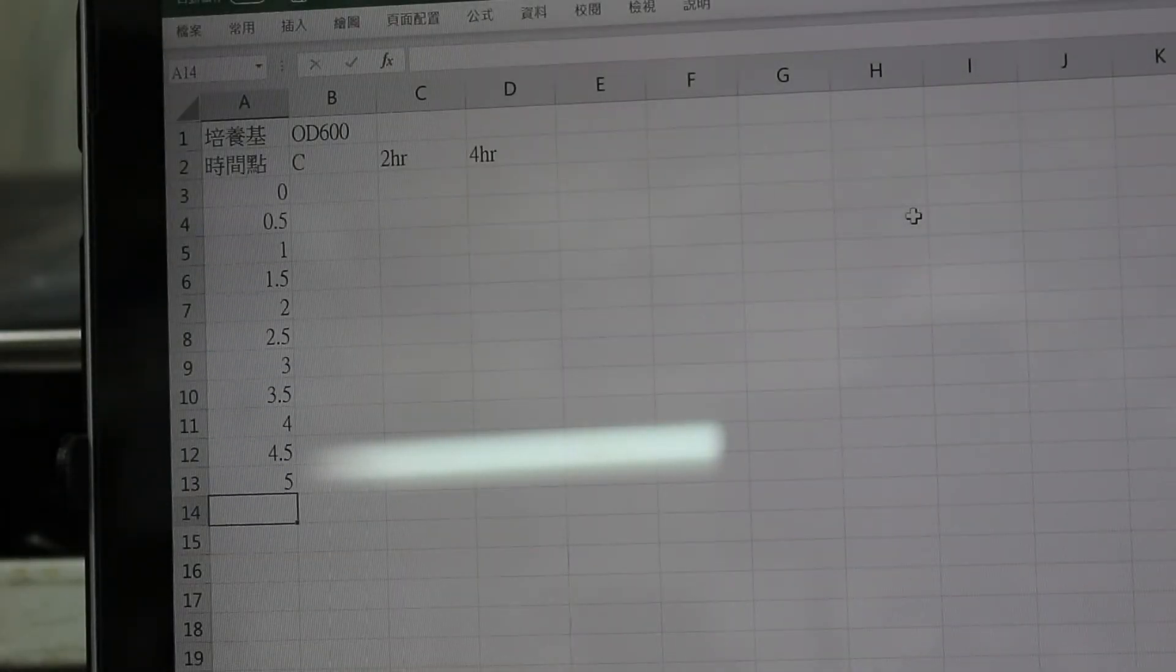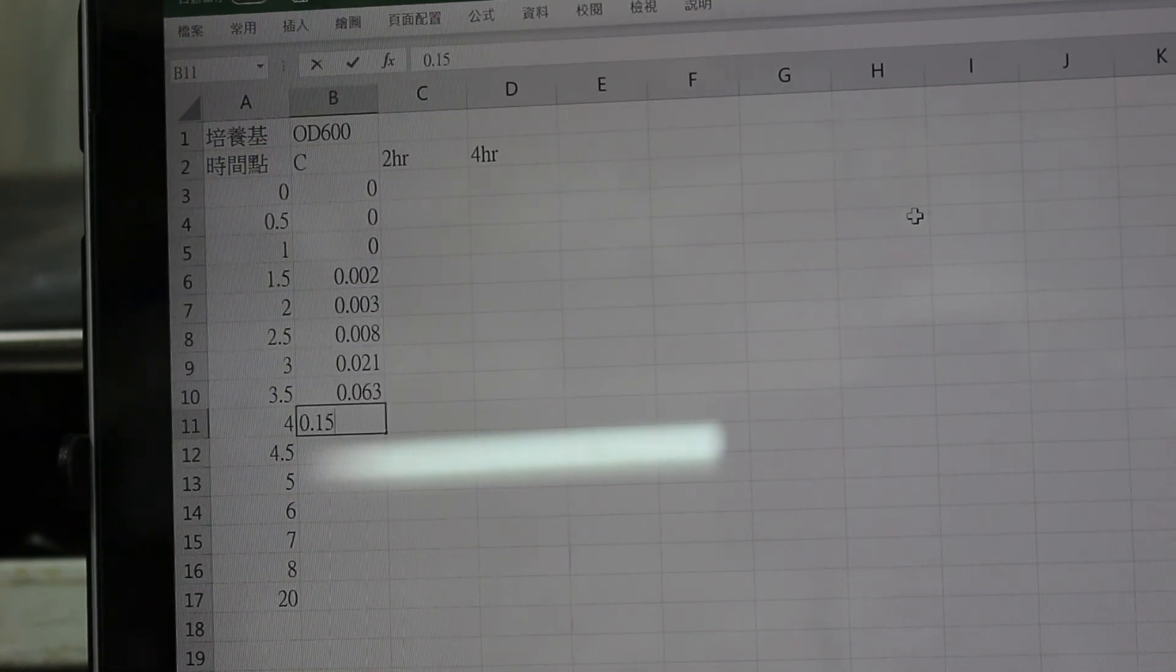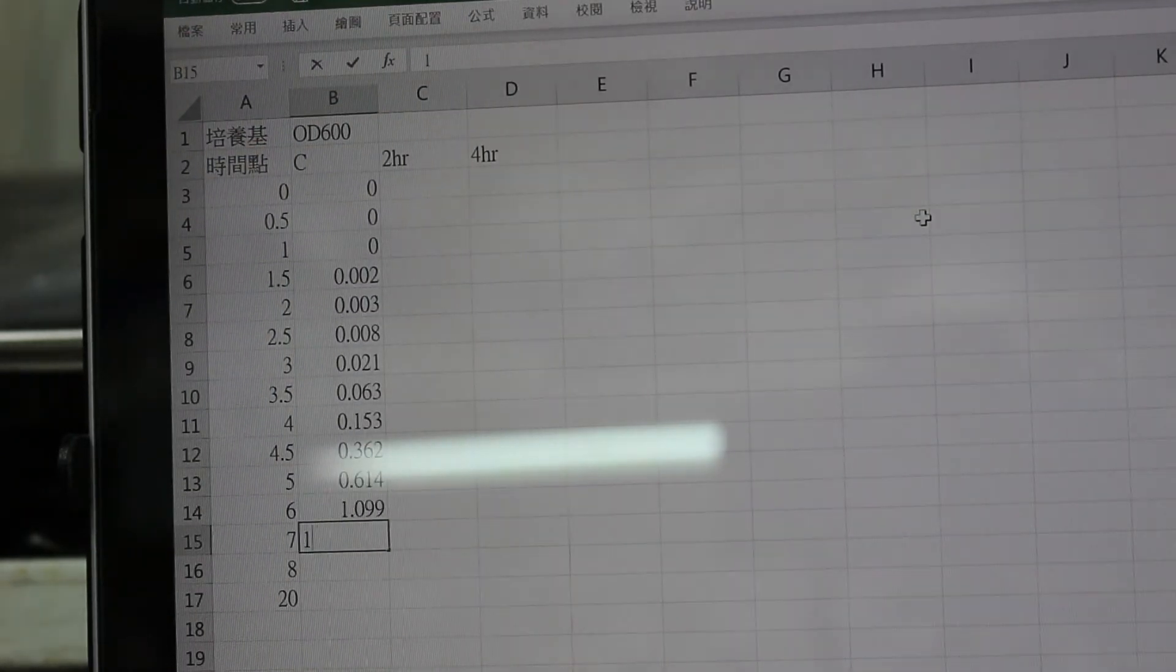After 8 hours of culturing and measuring, I have the data I need. The growth curve looks like this.